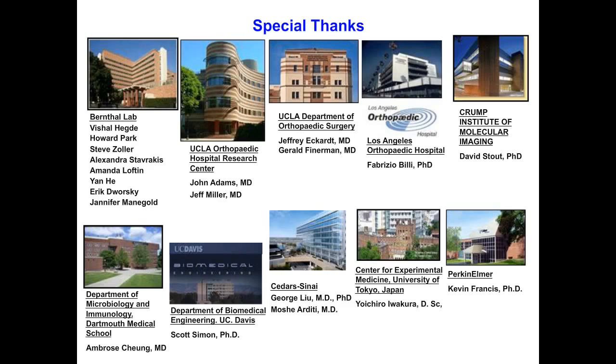What is the largest animal species with which you have experience, and which anesthesia agent do you use most frequently? So traditionally, nowadays, the anesthesia we use is isoflurane mix. It's about 2% that we use for mice and sometimes rats, mixed in oxygen or air. Generally speaking, most institutes nowadays either use isoflurane through a vaporizing system, or you can also do injectable anesthetics.